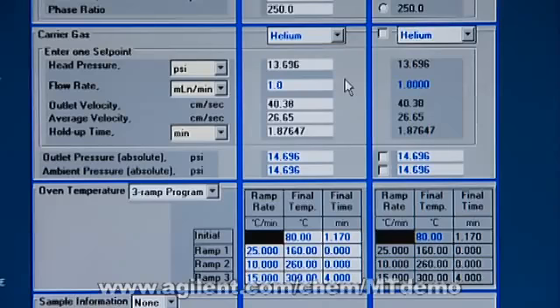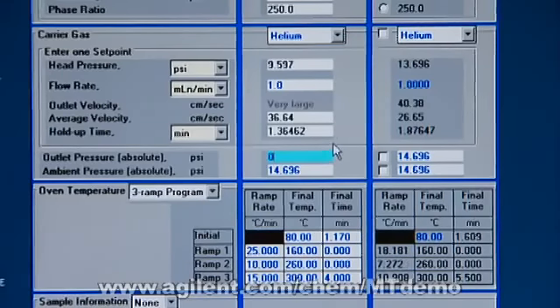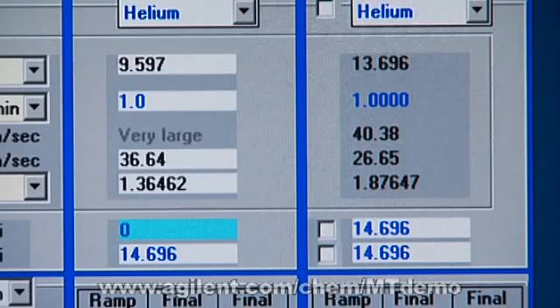Now, I can simulate what it would look like if I use this particular analysis with a mass spec. So we put zero in the outlet pressure, and now I've got what it looks like at a mass spec. The head pressure goes to 9.5 psi. Quite a bit of difference.